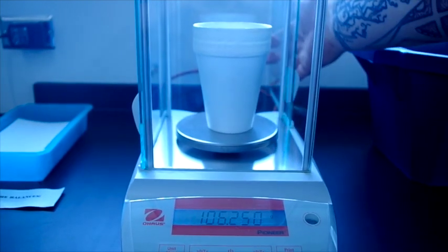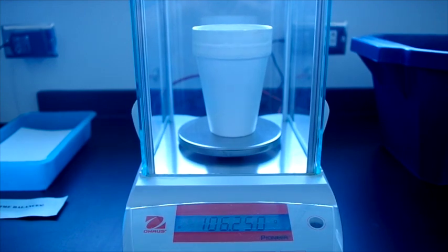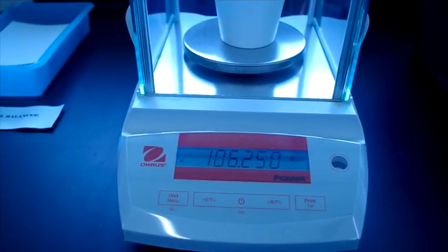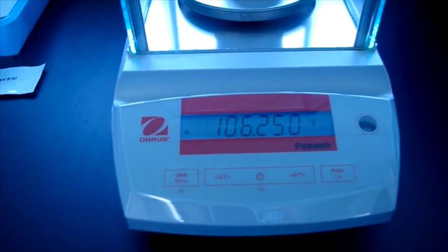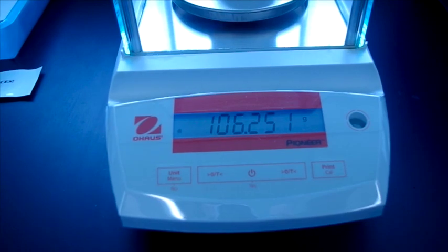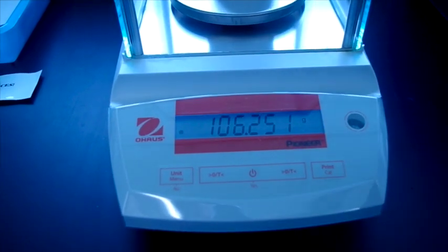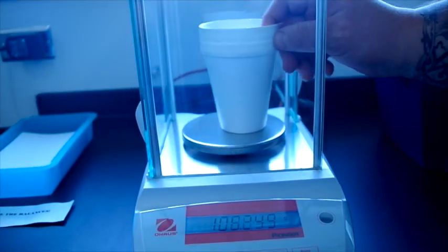Take the mass again. Look at the mass now. 106.250. All right, now take this out.